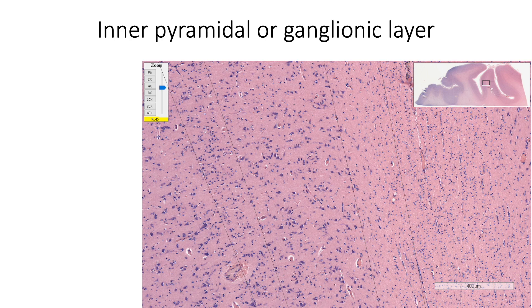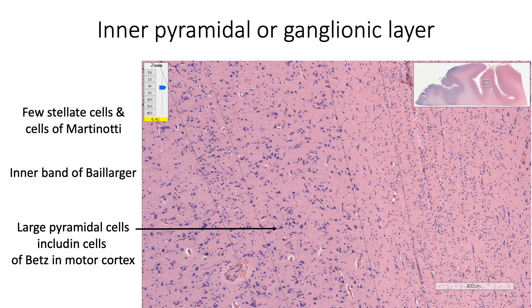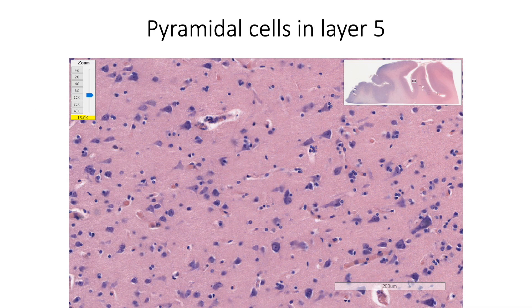The fifth layer, or the inner pyramidal layer, also called the ganglionic layer, consists of large pyramidal cells, including the Betz cells in the motor cortex. We also find a few stellate cells as well as cells of Martinotti in this layer, along with the inner band of Baillarger. From layer 2 to layer 5, the size of the pyramidal cells keeps increasing. Here we are seeing the large pyramidal cells of the fifth or ganglionic layer.